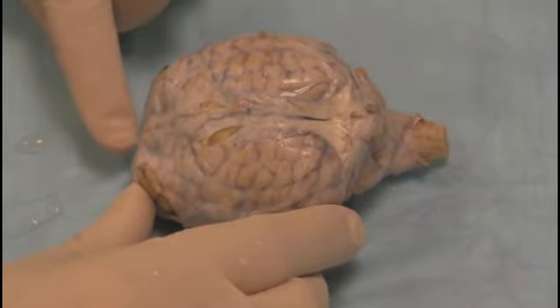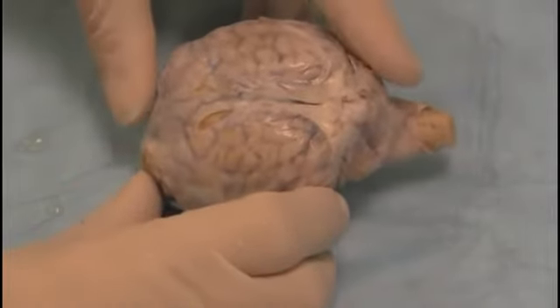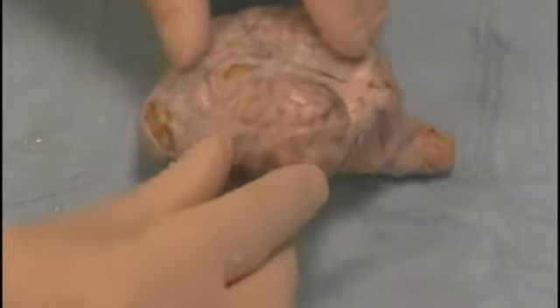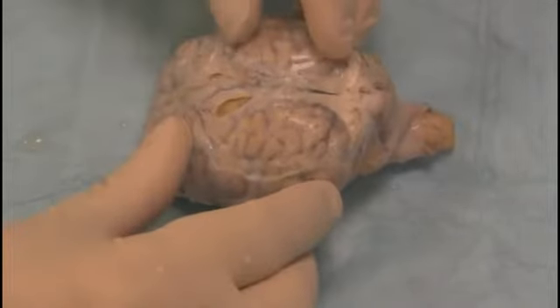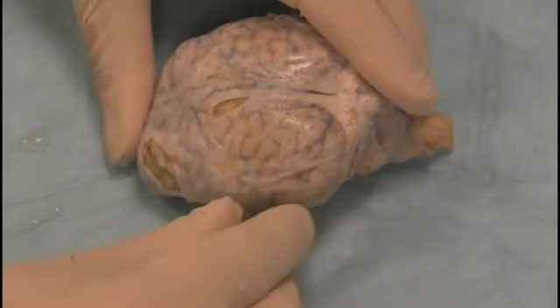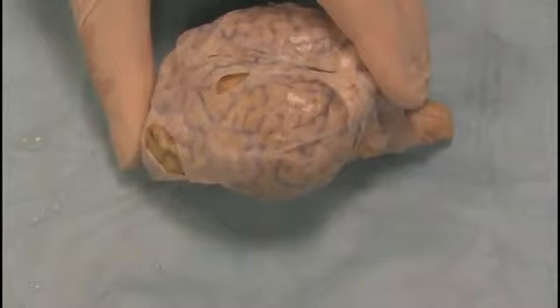This is the rostral end, where the nose is, and this is the caudal end, where the spinal cord is. The first thing we can see is that the brain is covered all over by a very thick, protective membrane. So the first thing we're going to do is get rid of the membrane so we can get a closer look at the brain structures.